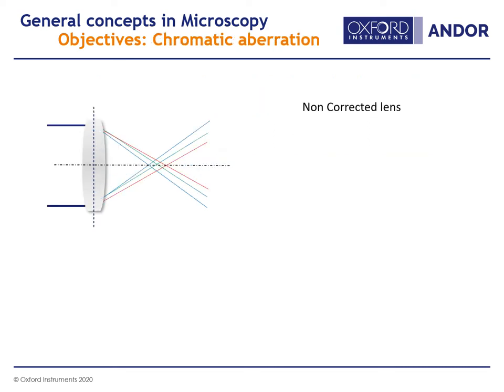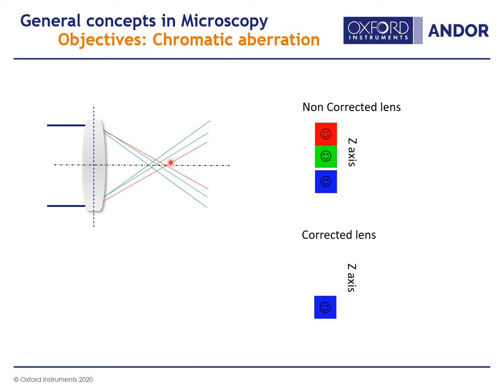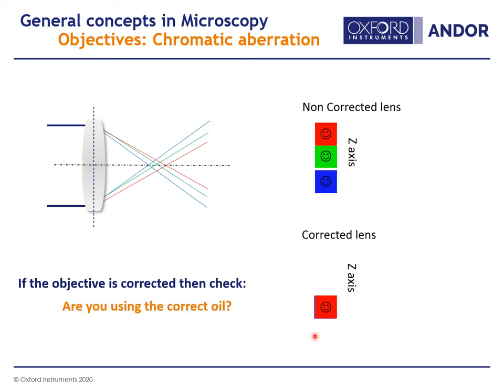Another correction in objectives is for chromatic aberration. Different wavelengths of light, if the objective is not corrected, will focus in different planes. On a non-corrected lens, a multicolor dot that should co-localize will appear as if the colors are in different z-planes. If the objective is corrected, all wavelengths focus at the same point and all colors appear in the same z-plane. If your objective is corrected, also check that you are using the correct oil to correct for refractive index mismatch, which can also cause some chromatic aberration.